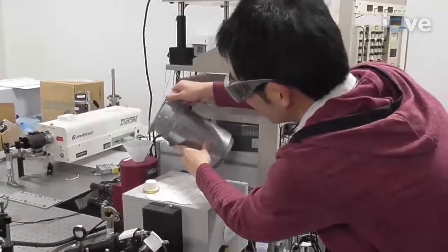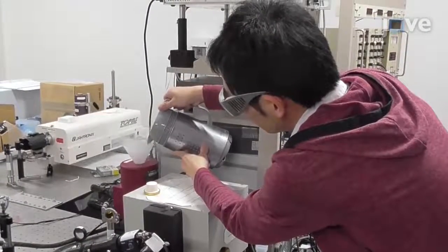Cool the mercury-cadmium-telluride IR detector with liquid nitrogen.